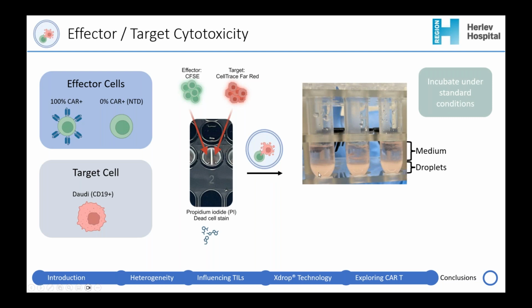So what comes out of the cartridge is this suspension. So we have the droplets that come down to the bottom, and then they sit with media and the cells, and you can just incubate these at 37 degrees, just like they are regular cells. Yes, and then so we took these over a various time course and ran them on our flow cytometer.